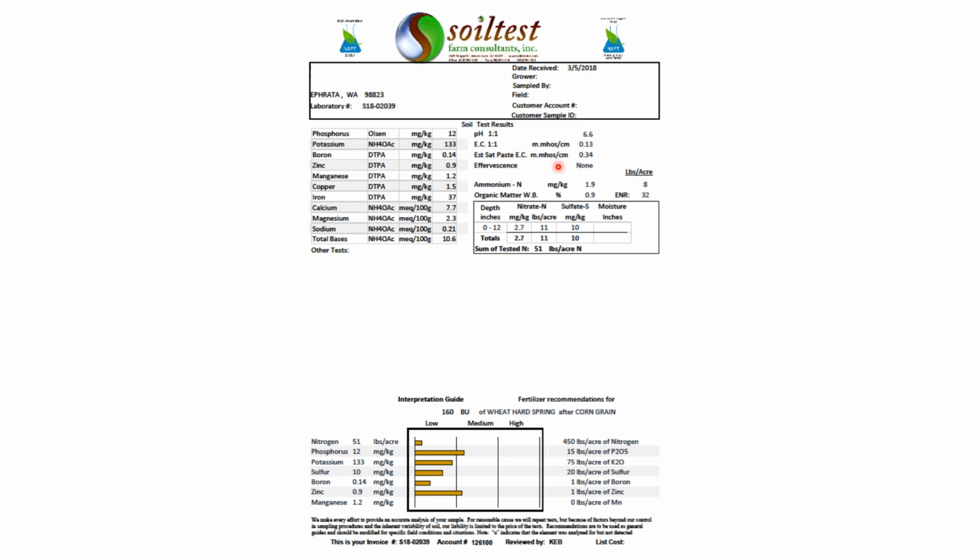This box on the right is used to show nitrogen at various depths in the soil. First of all, we'll measure nitrogen in 3 forms: ammonium nitrogen, nitrate nitrogen, and then include a contribution from organic matter breakdown and mineralization. Let me show you how this works. In the laboratory, we'll report ammonium in milligrams per kilogram. This is the same thing as parts per million, in our case 1.9.